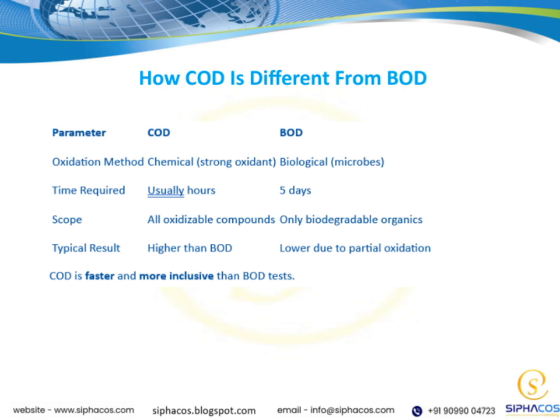On the other hand, COD measures the total amount of oxygen required to chemically oxidize all organic substances in the water, including those that microbes can't easily break down. So, COD provides a quicker, more comprehensive snapshot of the total organic load, regardless of whether those substances are biodegradable. Understanding these differences helps us interpret water quality data more accurately and decide on the best treatment methods. It's a key part of our overall theme, assessing and managing water quality effectively.